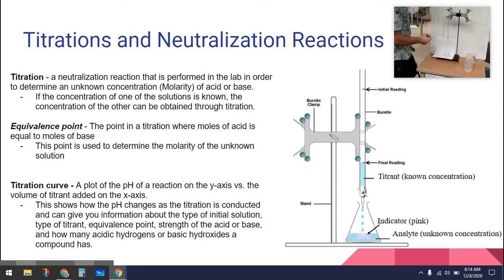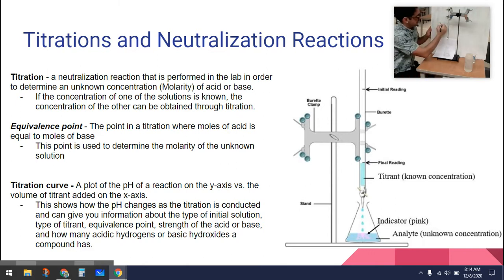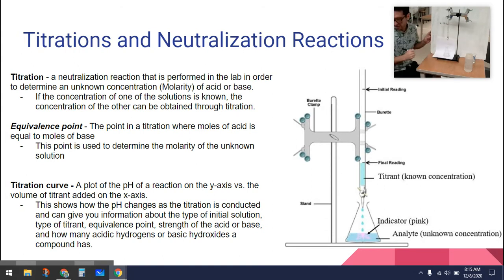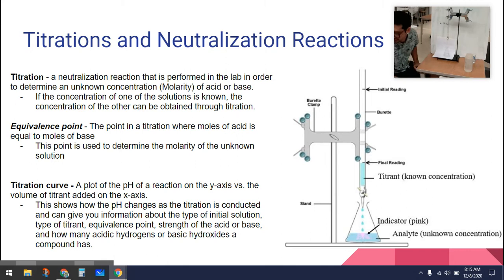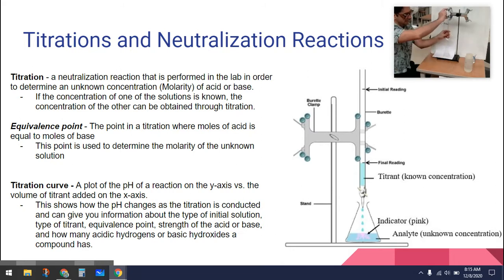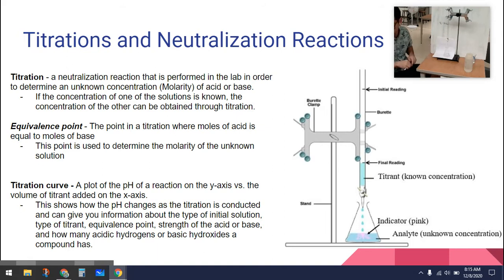So our initial volume is 17.4 milliliters. Then we're going to add the NaOH until it turns pink. We're going to have to add about 10 milliliters. And you can actually see that as you add it, you'll start to see it turn pink.